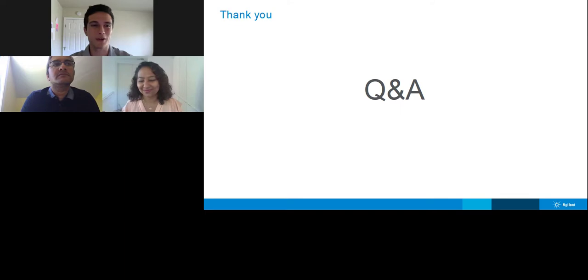Thank you. And one more question for you, Mimi. What are the aspects of these technologies that are most exciting for the future? The most exciting thing for me is really combining all of these technologies and taking them to that next level of process analytical technologies, in real time, if possible.